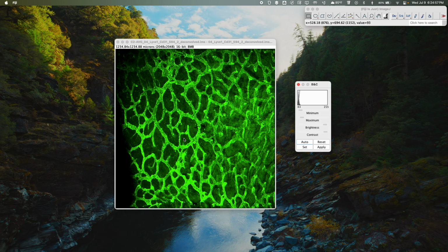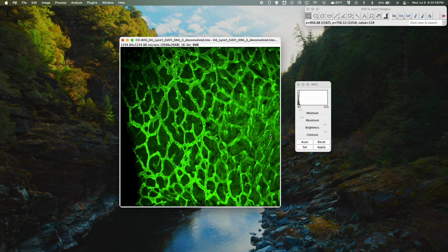And yeah, I think we've kind of gone back to the original image that we retrieved, maybe a little bit lighter with the vessels showing a little more, but it's a little bit clearer, at least for the software, to be able to see, okay, I see these vessels right here, vessels moving through here, and be able to outline them. So I think this is a good point where we can go ahead and save this image.